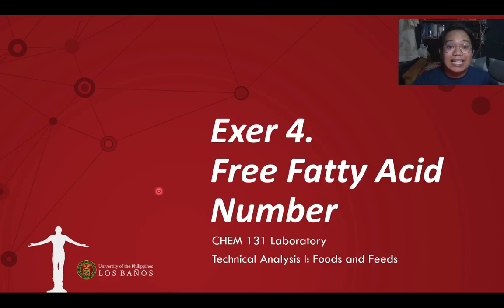as part of analysis of fats and oils. So, ang pinaka-gist ng free fatty acid number ay dinedetermine natin yung amount of free fatty acid, meaning, kaya siya free kasi na-liberate na siya from your triacylglycerol or triglycerides. So, kapag na-liberate siya, sabihin, na-deteriorate na siya. Kasi yung purest form of your oil ay yung nasa triacylglycerol na form.